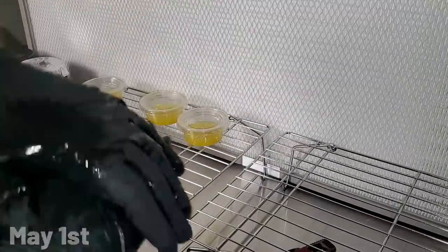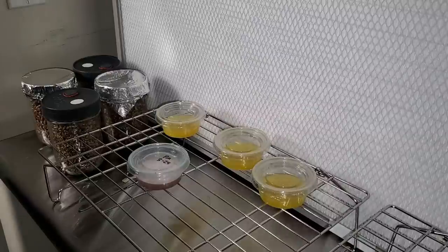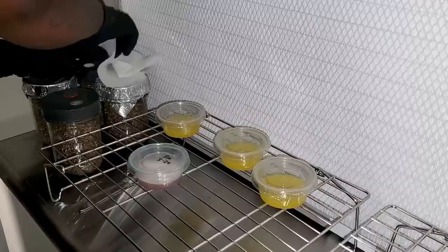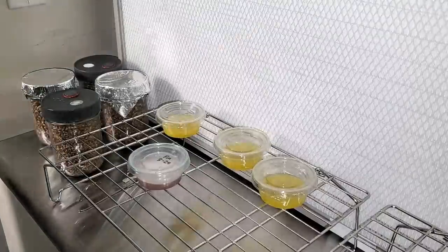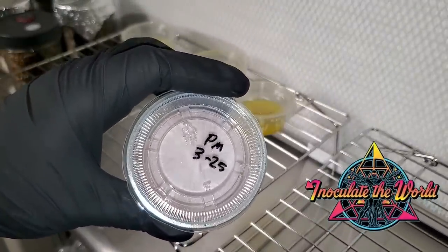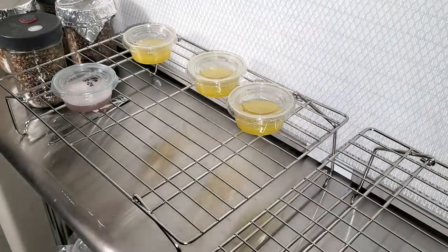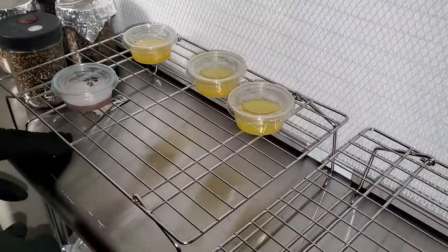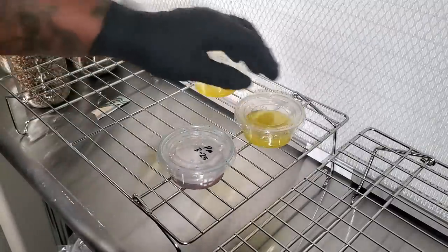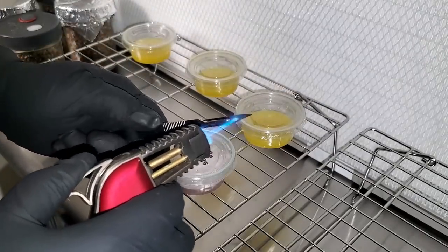It is now May 1st. As always I sprayed my gloves with 70% isopropyl alcohol, sprayed the table, wiped it down, and wiped the tops of the lids on the jars. The first thing you're probably noticing is I'm not in a still-air box anymore — I'm in front of a flow hood. This is a 4x2 Inoculate the World flow hood. If you're in the market for a flow hood I recommend getting it from Inoculate the World — they have different sizes from small to large. I will be doing a dedicated video on the flow hood.